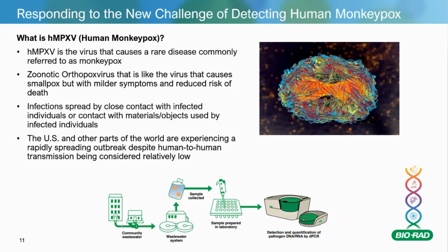So something that's really becoming more common these days is human monkeypox. Commonly, the way this is being monitored is by swabbing a lesion on the patient and collecting samples for testing. However, by this stage, infection is already well established and likely spread by the time these lesions are appearing. So wastewater-based epidemiology is a really good passive collection method, and we know that it's worked really well with SARS-CoV-2, and it can proactively detect virus in a community and supports powerful longitudinal trend studies over time.